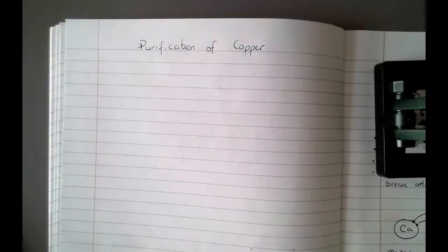Okay, so this is the last video on electrolysis, and it's about the purification of copper, which is a core practical. We've seen in previous videos that we use electrolysis to extract metals from compounds. In this video, however, we're going to look at a slightly different application for electrolysis. We're going to look at the use of electrolysis to purify copper.